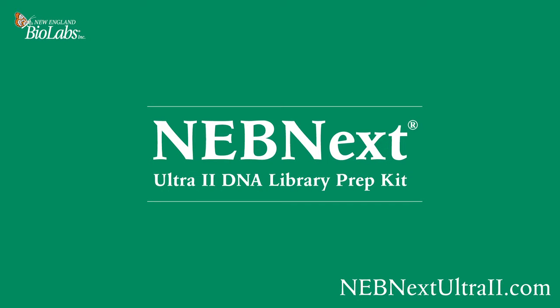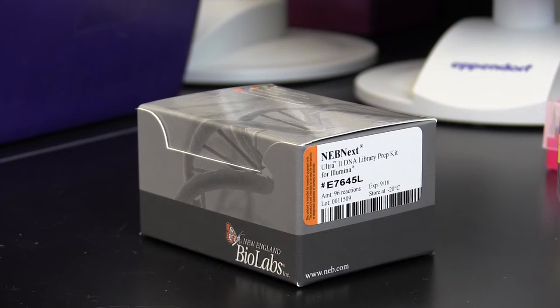Today we're going to show you how to make DNA libraries using the NEBNext Ultra 2 DNA Library Prep Kit for Illumina.